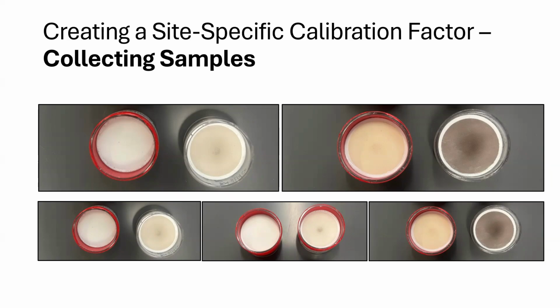You will need to collect a sufficient amount of representative samples in your field. You should collect at least 10 filters that you will use to build your calibration curve. These filters can be collected on different days in different locations, and also aim for a range of sample masses. All these are to ensure realistic and reliable results.